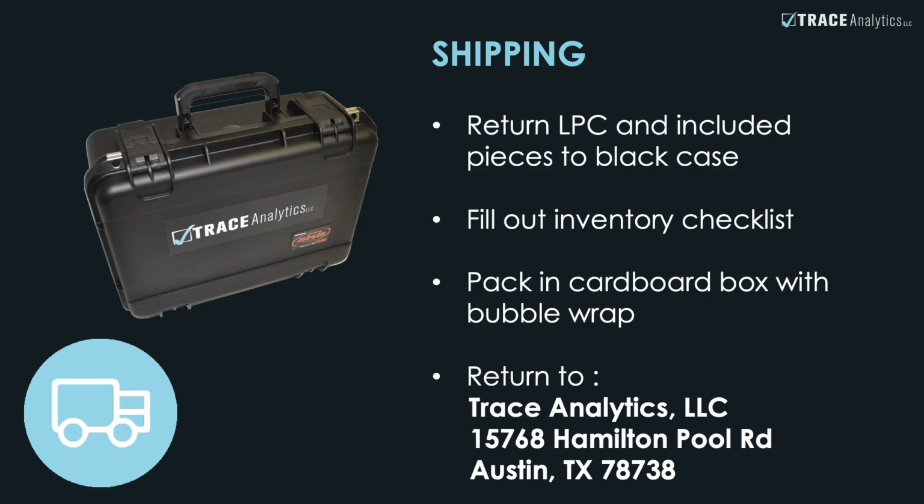Finally, attach the return shipping label and send back to Trace Analytics. You have now completed sampling.